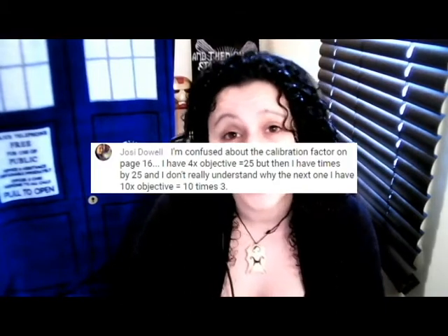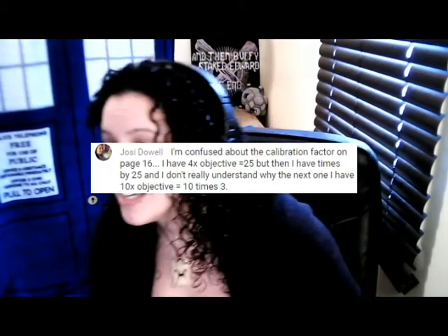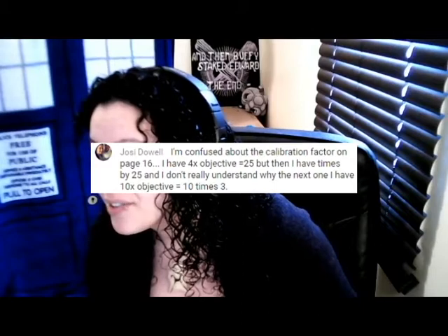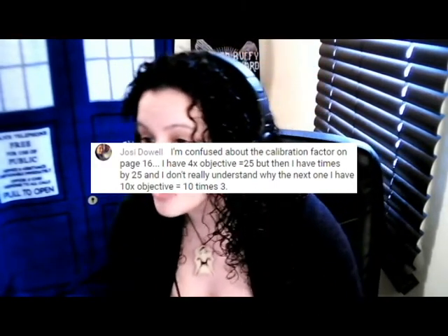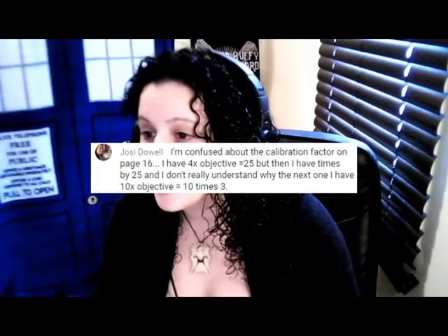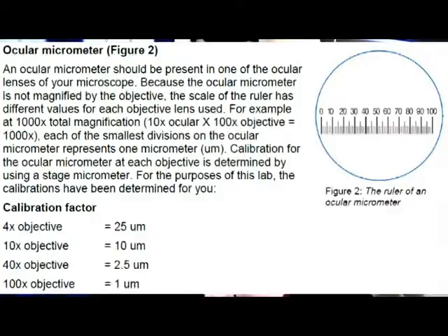Now we have a question from Josie. You're confused about the calibration factor on page 16. You have objective 4x, and that equals 25. I think I remember what you're talking about. On page 16, just above exercise 1, there are the calibration factors next to the ocular micrometer.